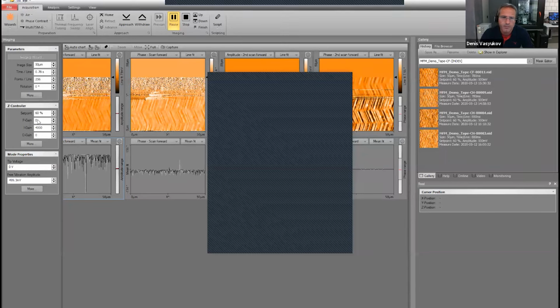P gain, we see it affects the images very little in flat samples. Also, it's a polymer film. But in this particular situation, other gains will not do anything. And when the second pass is done, the Z controller is off anyway. So whatever these values are, they're not affecting the magnetic image. Well, I hope that answers the question.